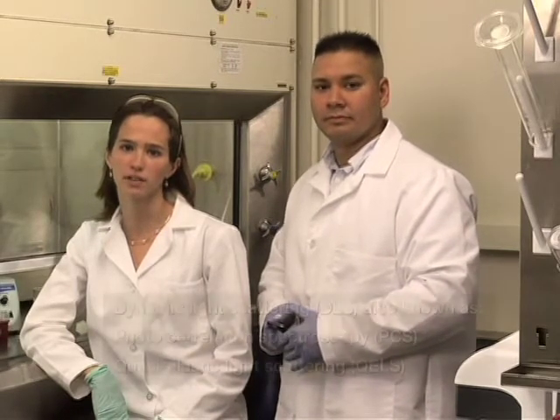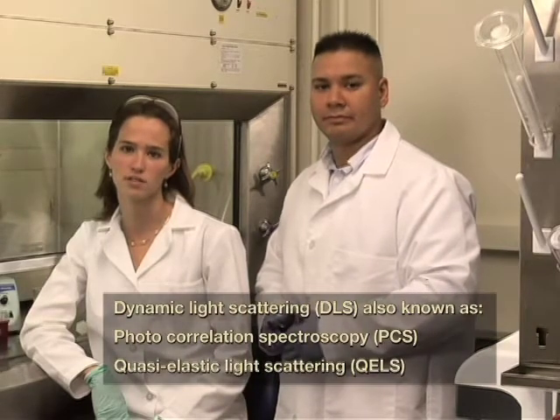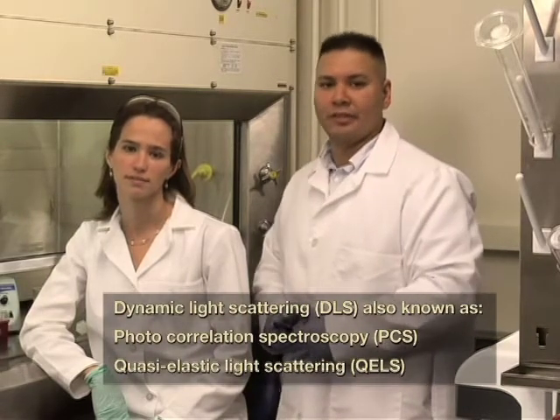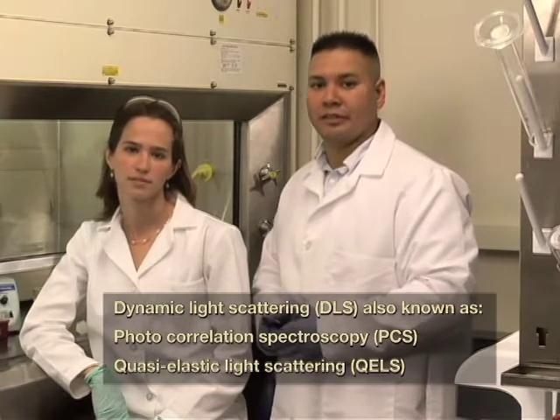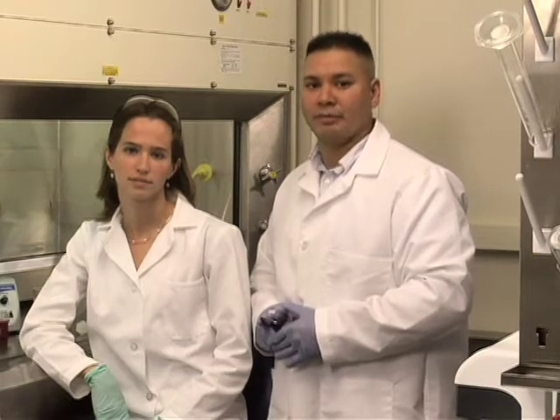In the next few minutes, we will show you how to prepare samples and determine the hydrodynamic diameter of a nanoparticle using batch mode dynamic light scattering in dilute aqueous suspension. This protocol is a simple, accurate, and non-destructive method to determine the size of nanoparticles. We will give you guidelines for making successful size measurements in the nanosize range. At the end, we will conclude with a discussion of relevant standards and data analysis.